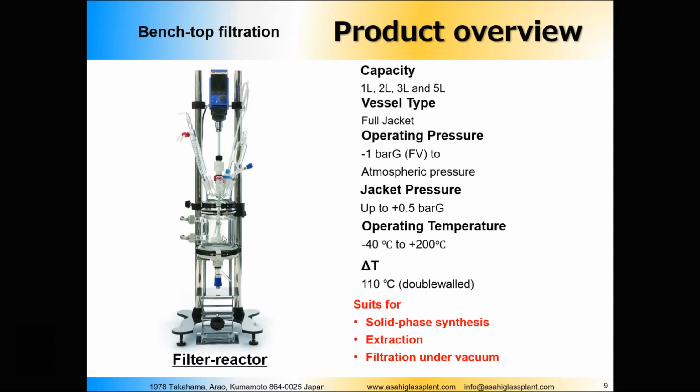So the reaction will occur in the upper part, in the lower part, and, what is most important, it will also occur in the filter itself, in the filter tissue, the filter material. So it will be completely choked up.